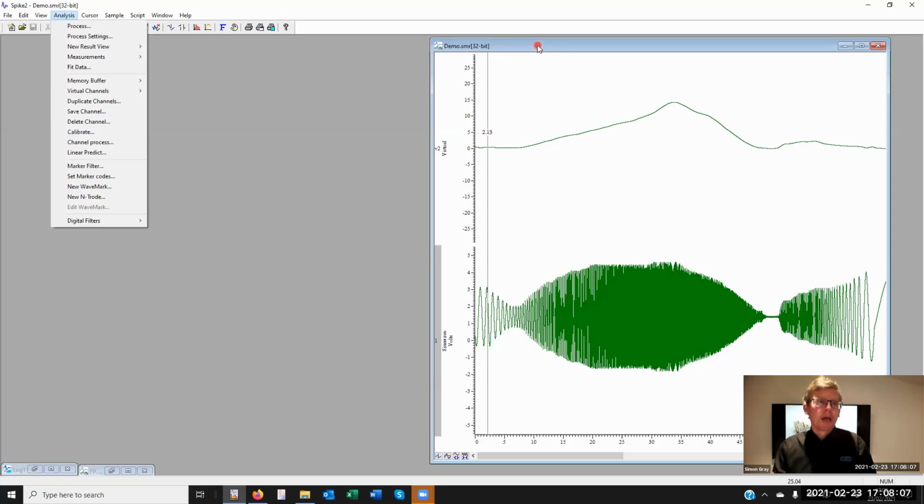Okay, at the end of all of these sessions, we'll be putting all of this together. So we'll have a complete experiment and we'll go through all the setup from start to end. Type of 1401, the sampling configuration we'll need, any outputs we'll need, through to sampling, online processing, and finally offline analysis, and hopefully export to publication quality.